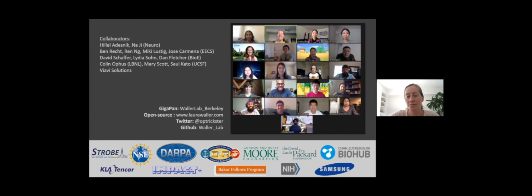Thanks. And a question which comes a bit more from machine learning, I guess: you are talking about translation invariance, but how about rotation invariance? Could you add something like this to help when the system is underdetermined? So rotating the sample? In DiffuserCam, if, for example, in a physical model, you add the fact that you have a rotation invariance. A bit like a lens, for example. So I don't know that we do have rotation invariance. We're thinking about 3D in terms of just looking from different angles.